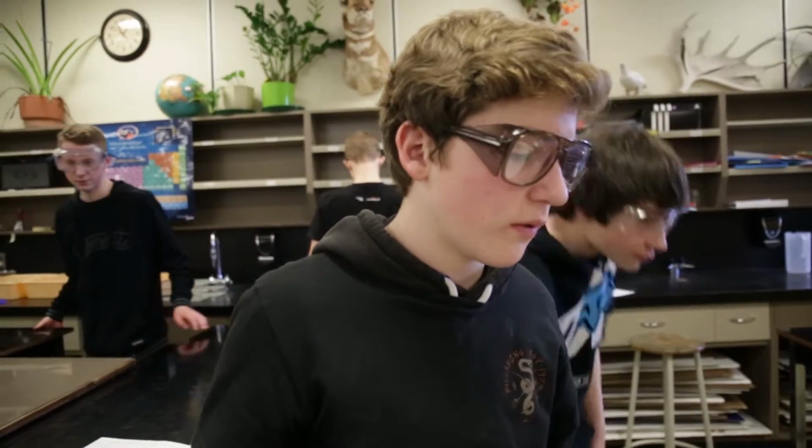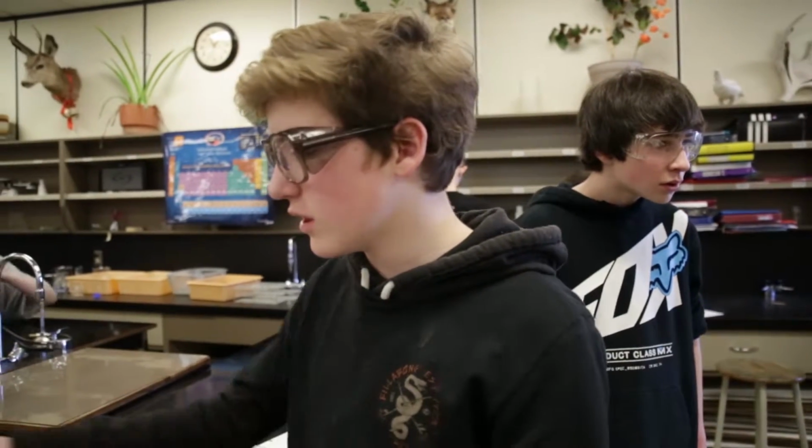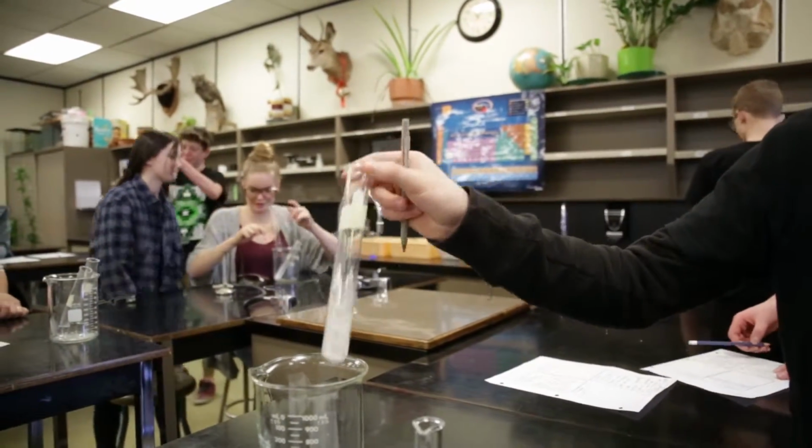Then the water started to evaporate really fast and turned to a white foam. After the water's gone, all that's left is the white foam. And when you let it cool, it turns into this weird white powder. Dude, it's actually smoking. Light this one. And that's observation A.